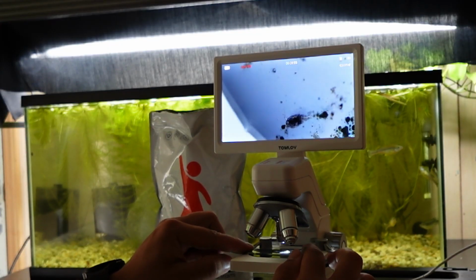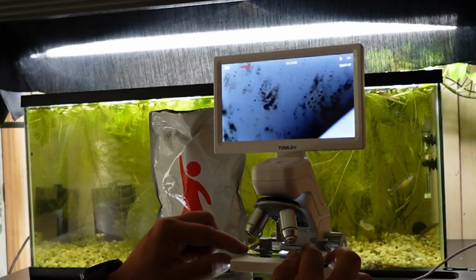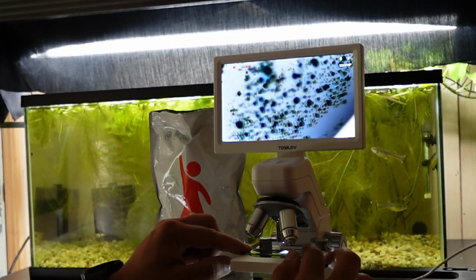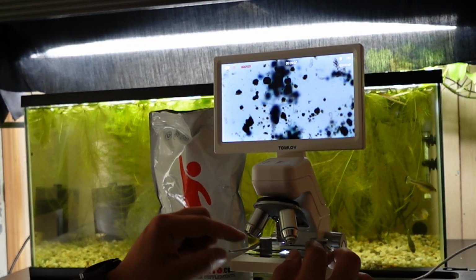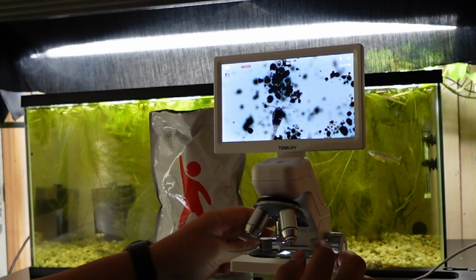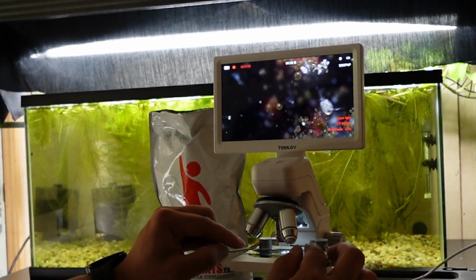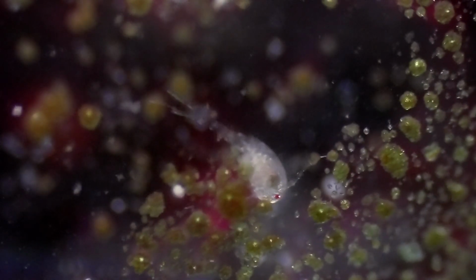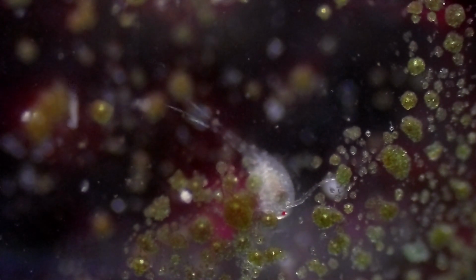So copepods love this stuff, and then your fish would love to eat copepods. Let's see what else we have. I don't see the other copepod. Oh wait, there's one right there. I was just zoomed in too much. Here's another copepod right here, just munching. Oh, he's munching, all right. You can see his eyes glowing red. That's his eyeball. Crazy.